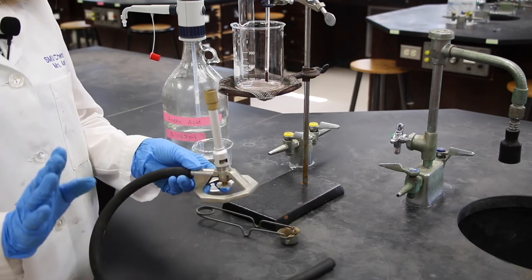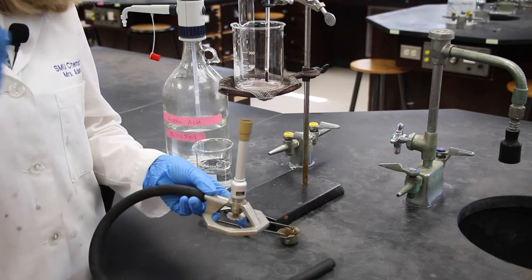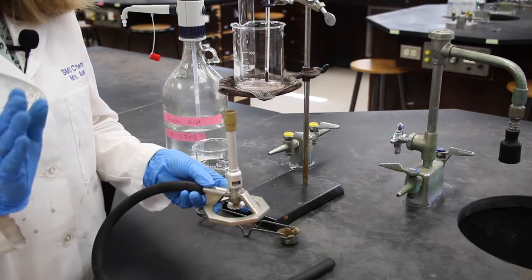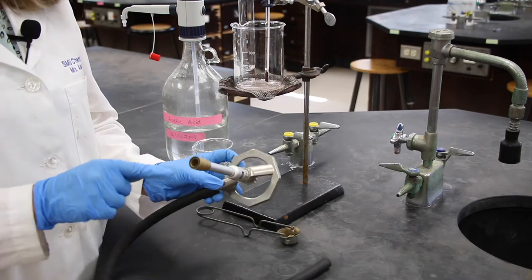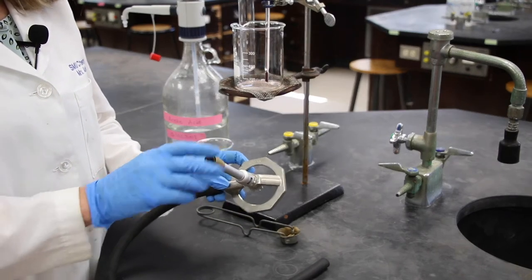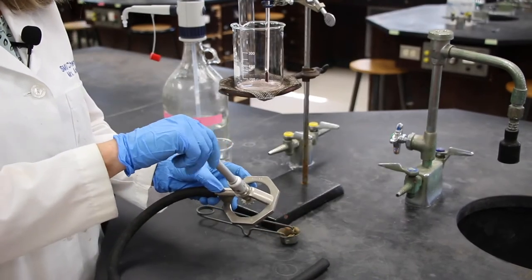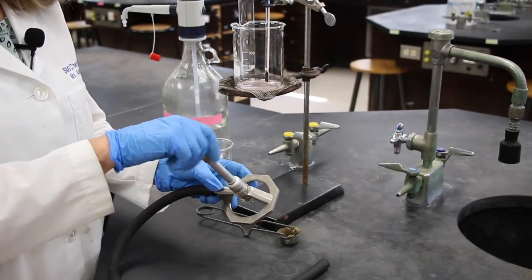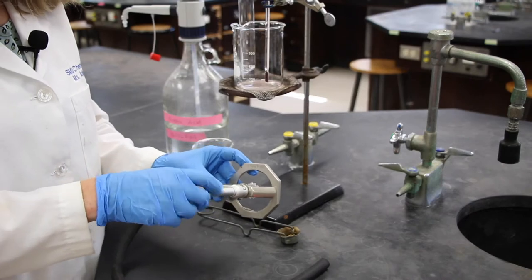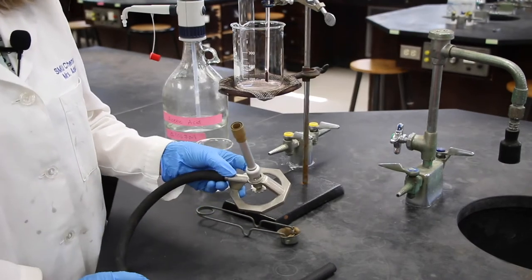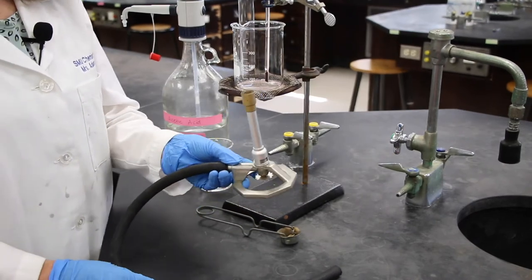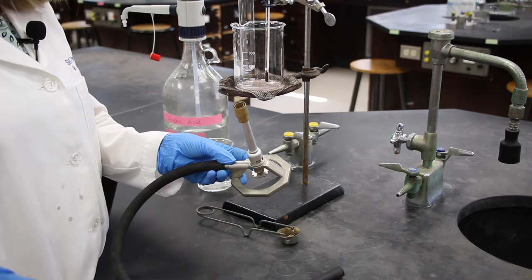The first thing we're going to do before we even start to light it is we want to turn everything off first. The easiest one is the air, and if you'll look down on the Bunsen burner, we're going to turn that clockwise. Righty-tighty, lefty-loosey.